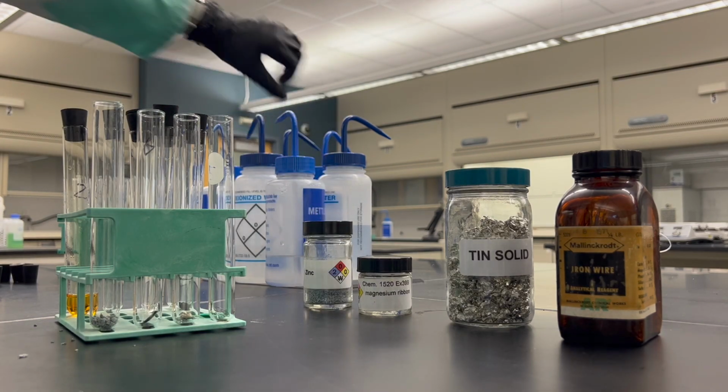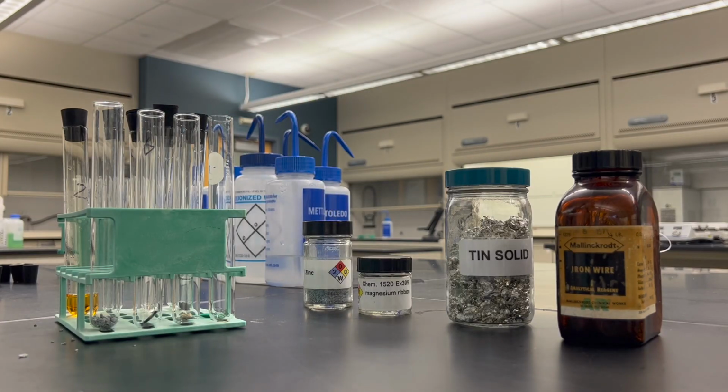Okay, so to each of these, I'm going to add just a little bit of water.